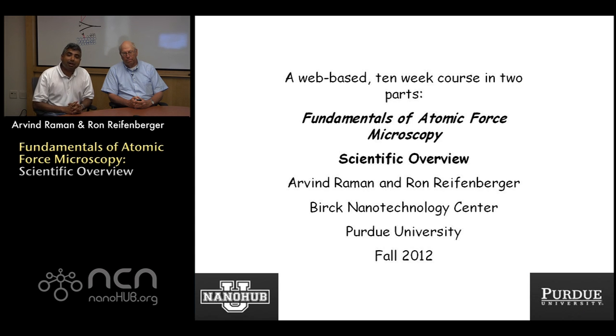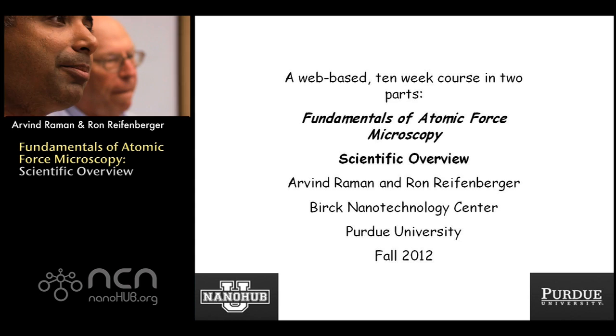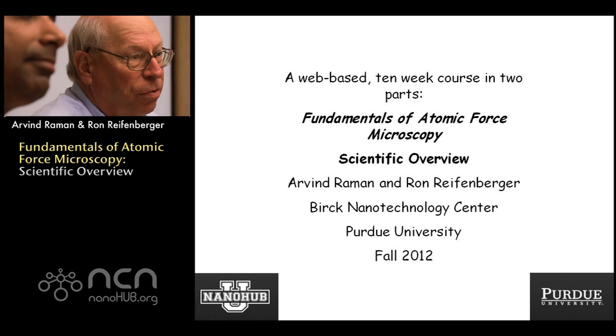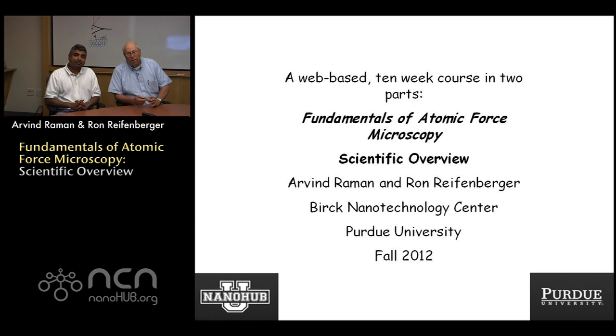Hi, my name is Arvind Raman. I'm a professor of mechanical engineering at Purdue. And I'm Ron Reifenberger, professor of physics at Purdue. Together we've developed this web-based 10-week course called Fundamentals of Atomic Force Microscopy. And in the next 10 minutes, we're going to provide you with a very brief scientific overview that summarizes the material that's covered in this course.